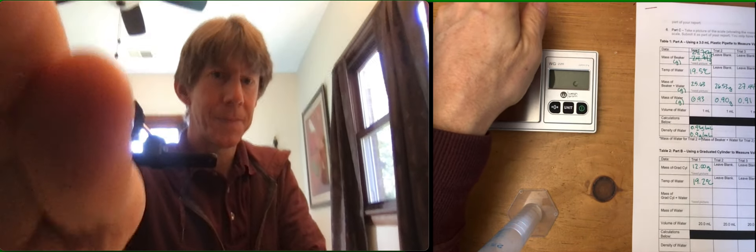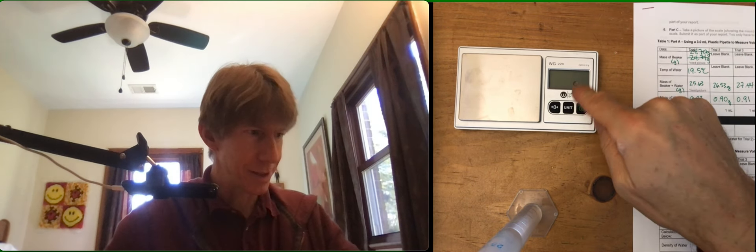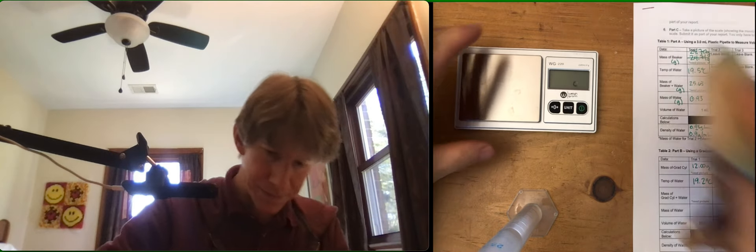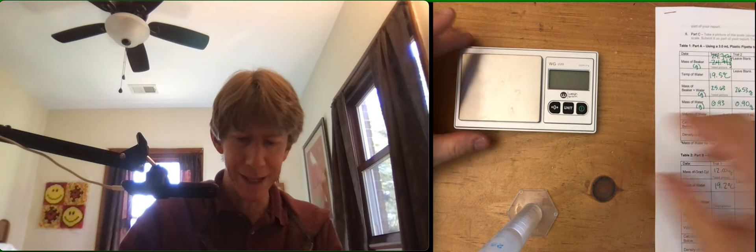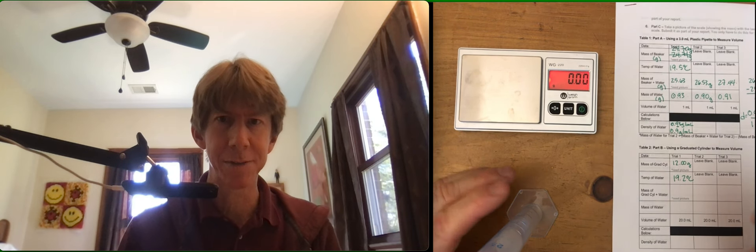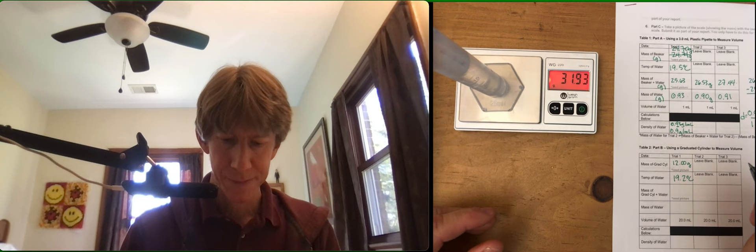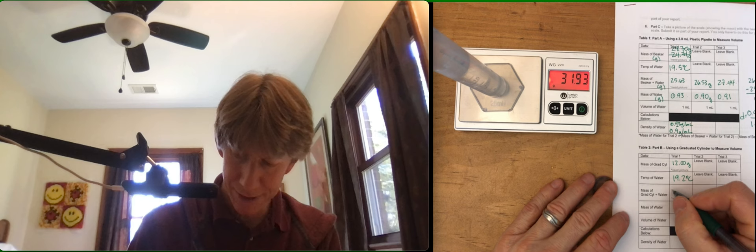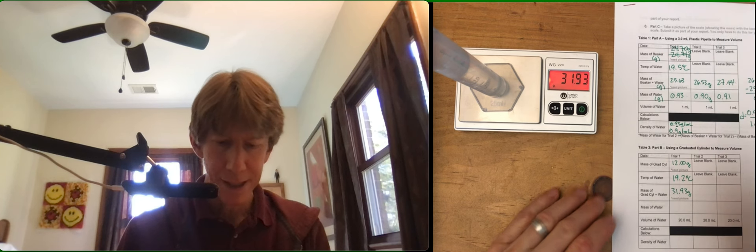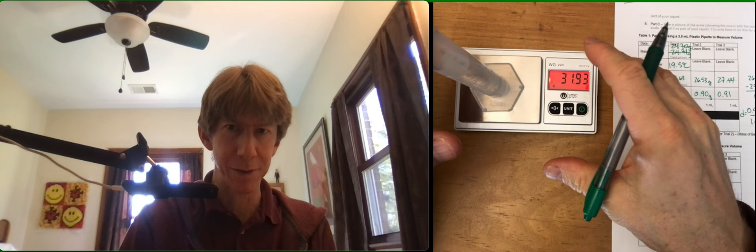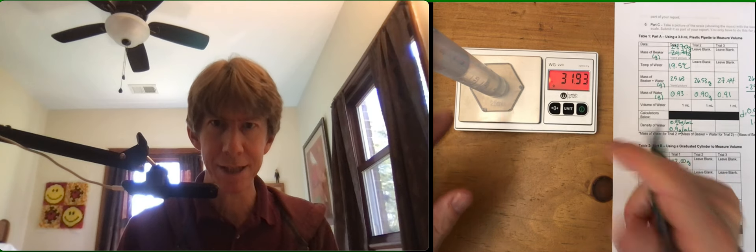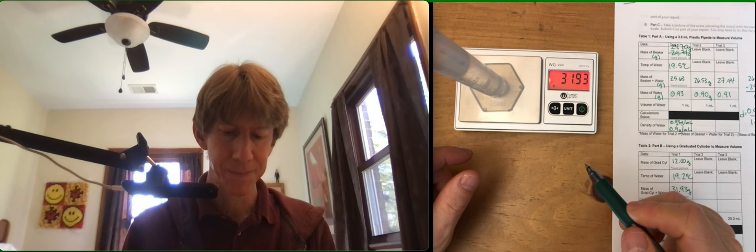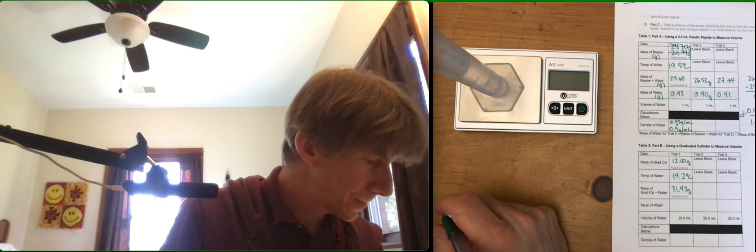Mass of grad cylinder plus water: 31.93 grams. Need a picture of that. So just like that, water scale, make sure I can see that the water is in it, which you can see the little line right there. Good. Where were we? Take a picture, record the mass.